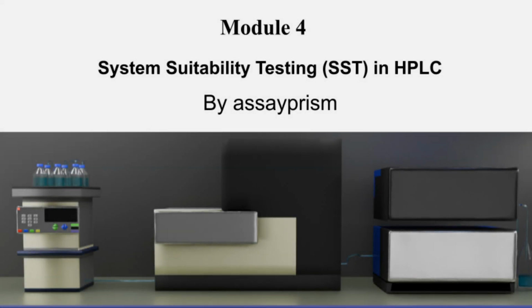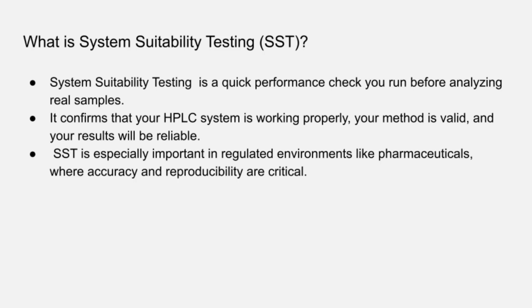Welcome to the fourth module. In this, we will talk about system suitability testing. System suitability testing is a quick performance test you run before analyzing the real sample. It confirms that the HPLC system is working properly, your method is validated, and the result will be reliable.